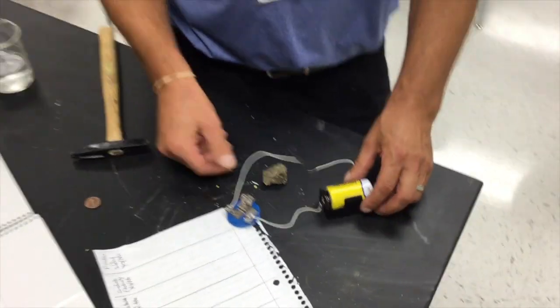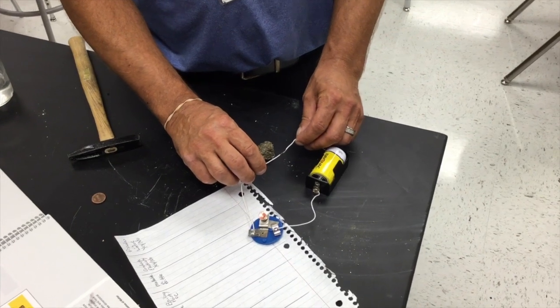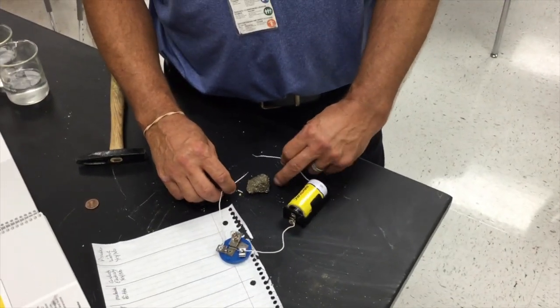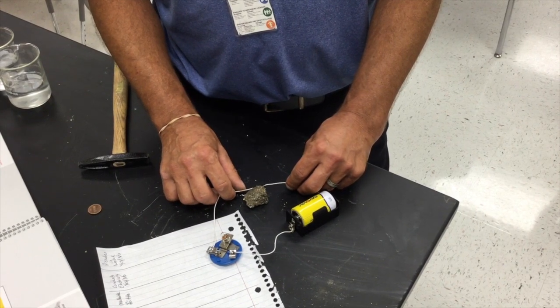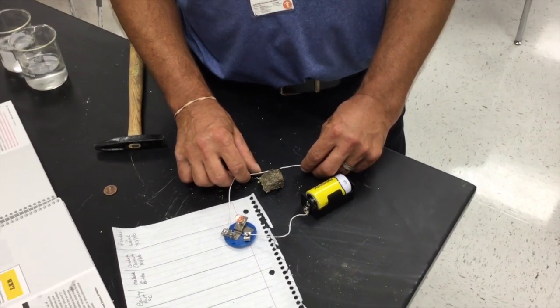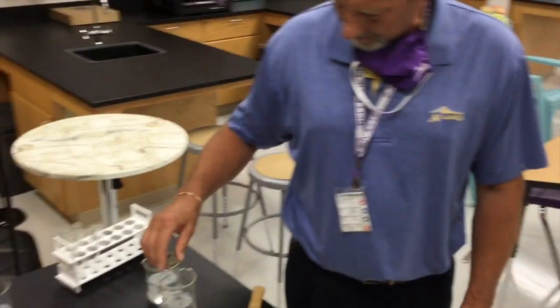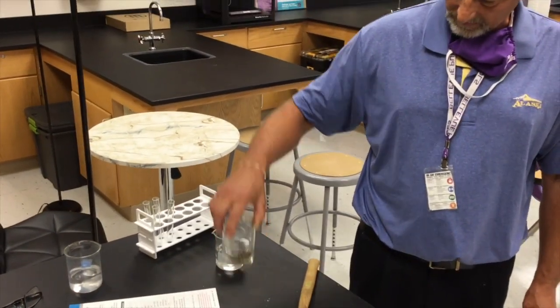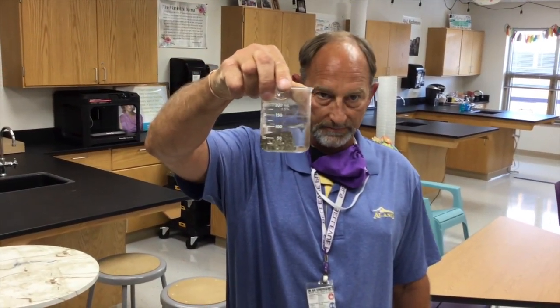Will pyrite conduct electricity? Remember, the light means yes, it does. And we can see pyrite being able to conduct electricity. The light is on. All right, and our last characteristic, as you can imagine, it does not dissolve in water.